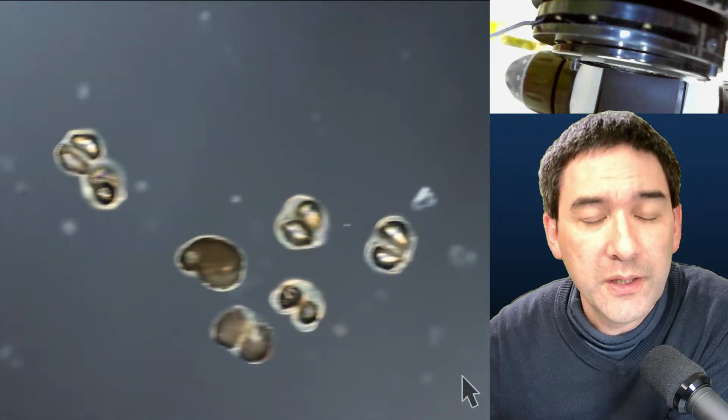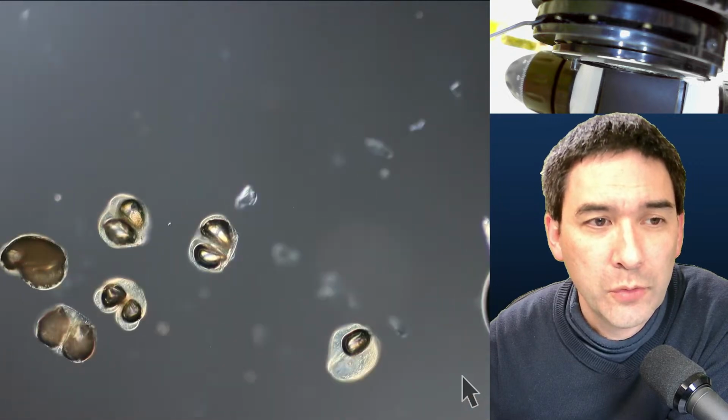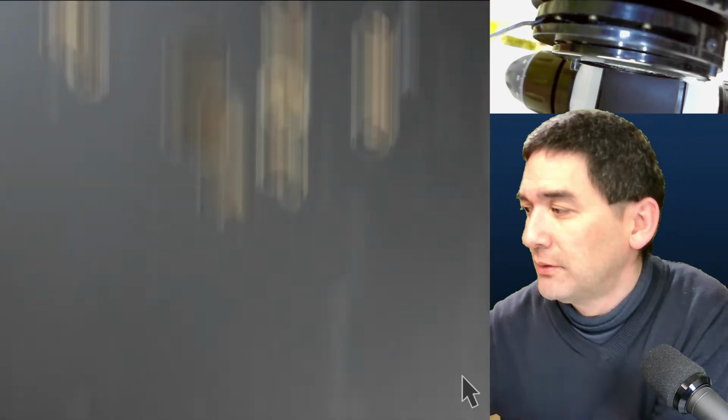But for pollen, as we can see, it looks very different. And if you just compare now the reflections with the air bubble over here, indeed it appears like there seems to be quite a bit of air inside the pollen. So I'm just going to show this to you first, and then I would like to show you the whole thing, of course, also using the filters.